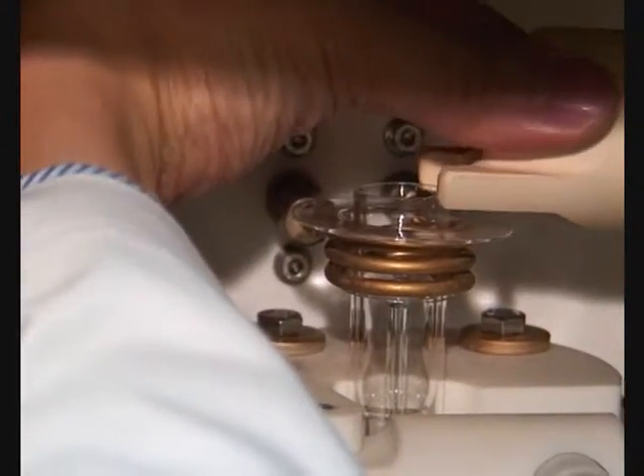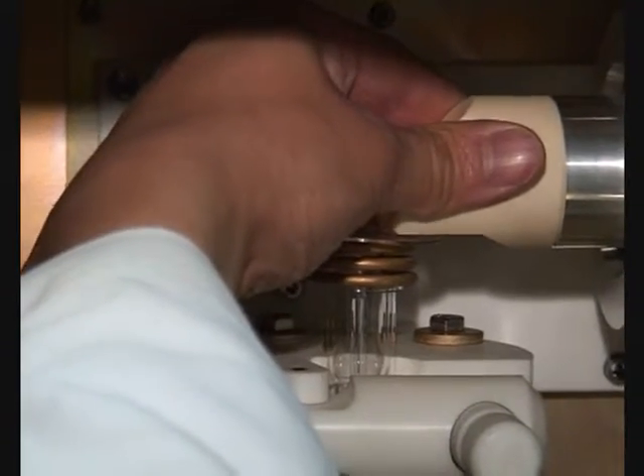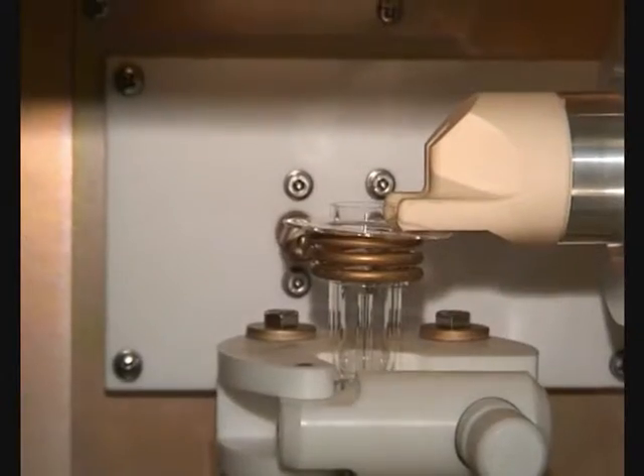Gently lower the snout until it rests on the bonnet, then slide the snout towards the torch so that the end of the snout touches the wall of the torch and rests squarely on the bonnet, ensuring that the viewing slot is vertical.